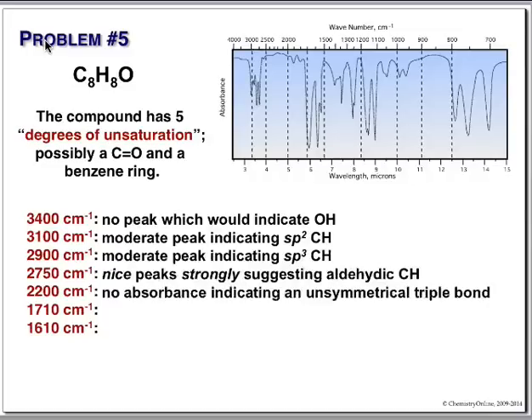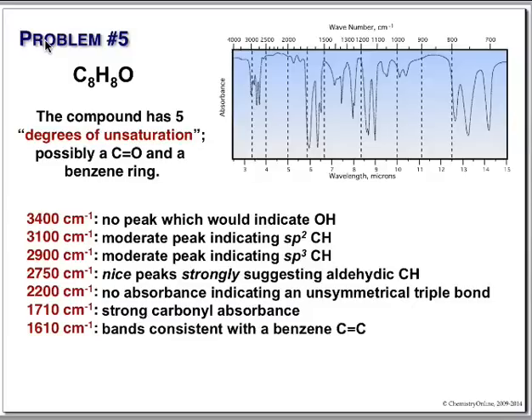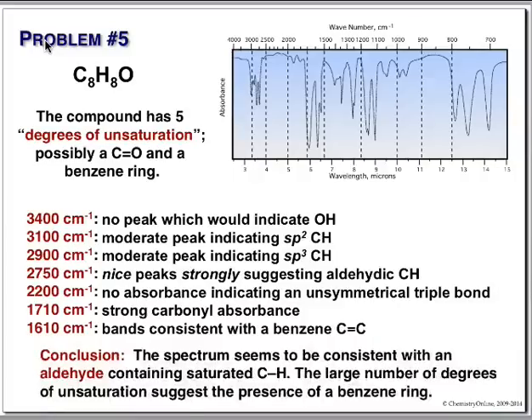2200, no triple bond. 1700, nice, sharp carbonyl, or broad carbonyl. We know that this carbonyl is an aldehyde. And finally, 1610, well, here's our 1600. Got another one there, something else here-ish. Yeah, that would be consistent with benzene carbon-carbon bonds. So we have a benzene ring. We have a carbonyl that's an aldehyde.